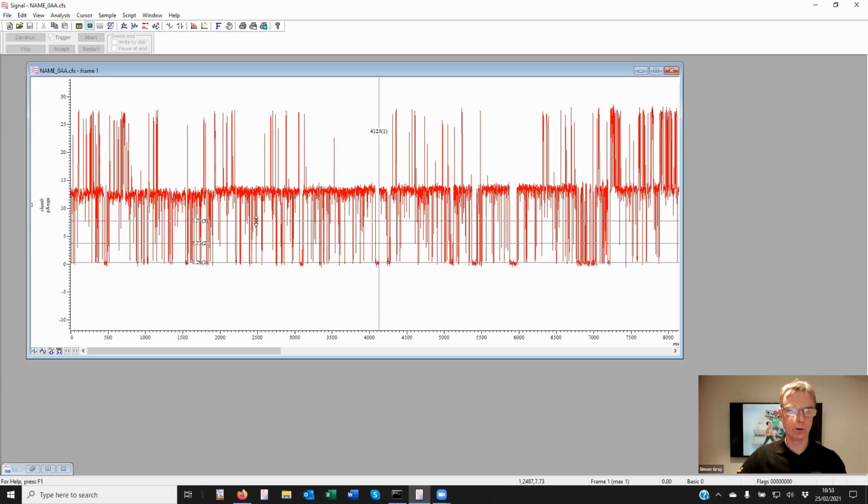One is a threshold it needs to cross in order to open, and the other one is a threshold it needs to cross in order to close again. The reason for having 2 separate thresholds is it makes you more immune to a lot of noise on your data. With very noisy data, putting a single threshold on is very tricky.